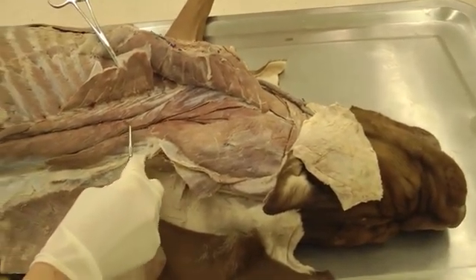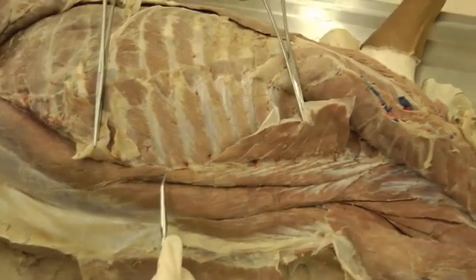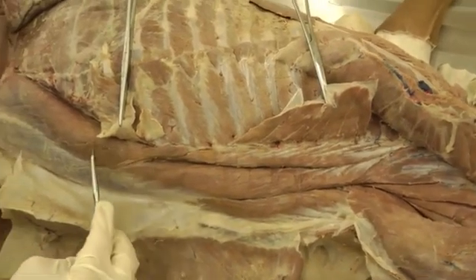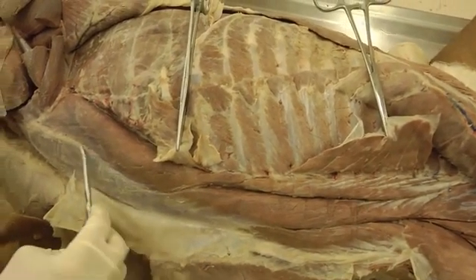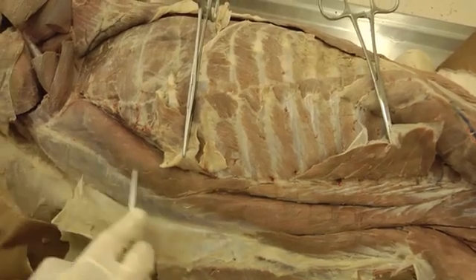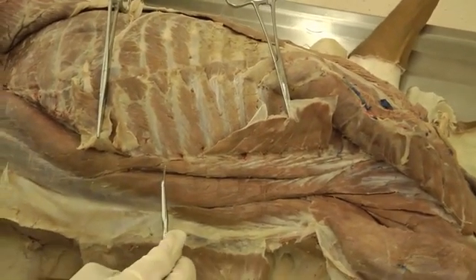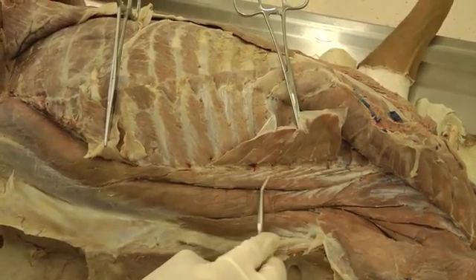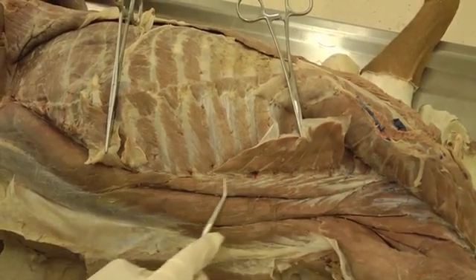So starting with iliocostalis — we have the iliocostalis lumborum, just the lumbar part, and that is fused with longissimus here. You don't need to separate them out or cut into this fascia. Lumborum is right here. And then we have iliocostalis thoracis, which is all of this part here that has these tendinous parts going to the ribs. So that's thoracis.